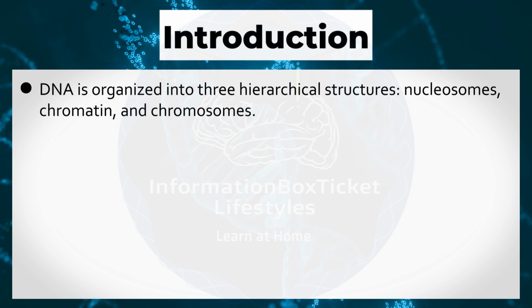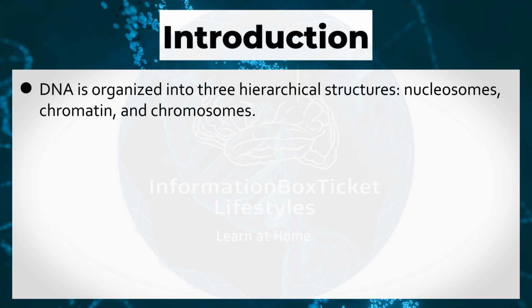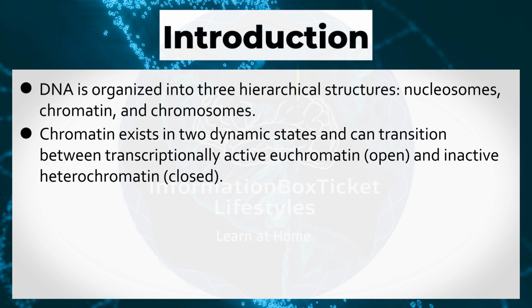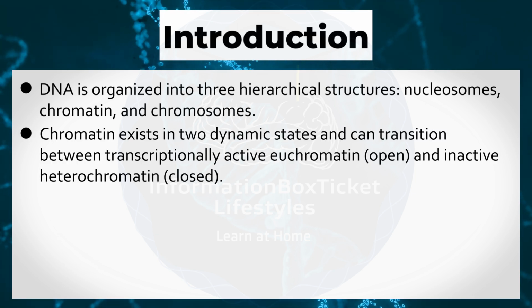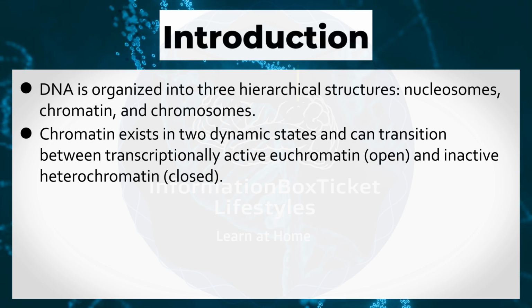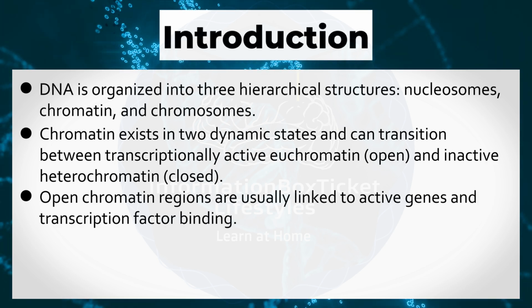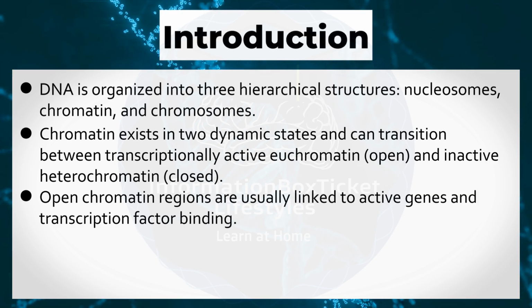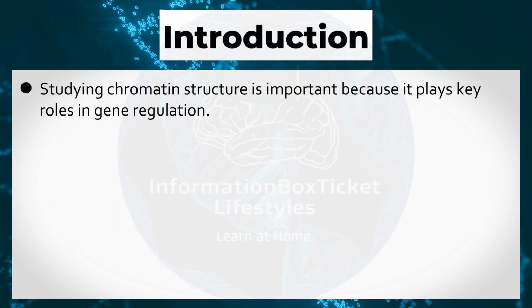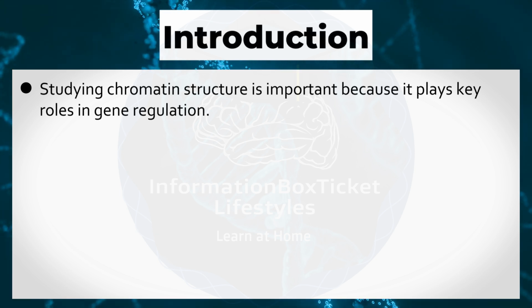DNA is organized into three hierarchical structures: nucleosomes, chromatin, and chromosomes. Chromatin exists in two dynamic states and can transition between transcriptionally active euchromatin, open, and inactive heterochromatin, closed. Open chromatin regions are usually linked to active genes and transcription factor binding. Studying chromatin structure is important because it plays key roles in gene regulation.